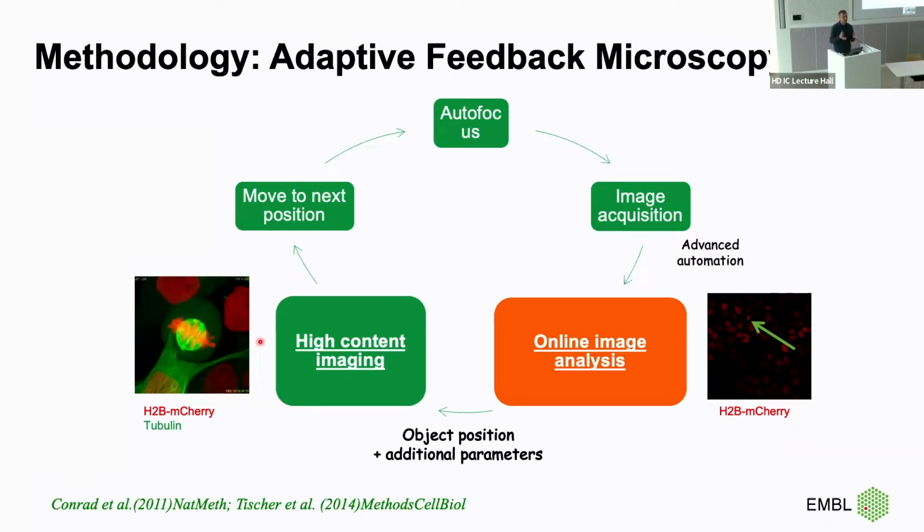And I would basically come to the examples of the feedback microscopy workflows which we had to deal with, and actually want to discuss with you how such a decision can be user driven while we still maintain the integrity and capacity of the systems.